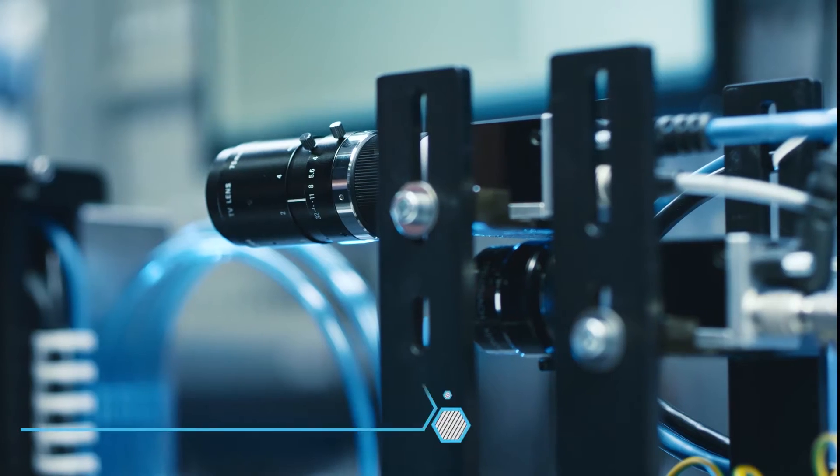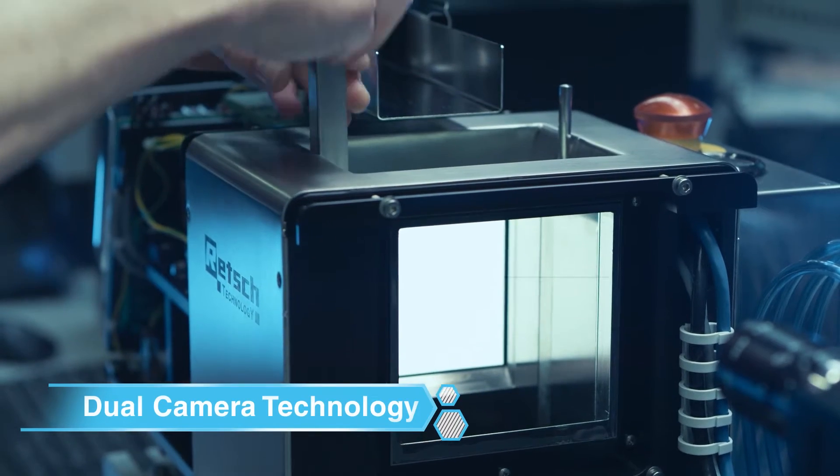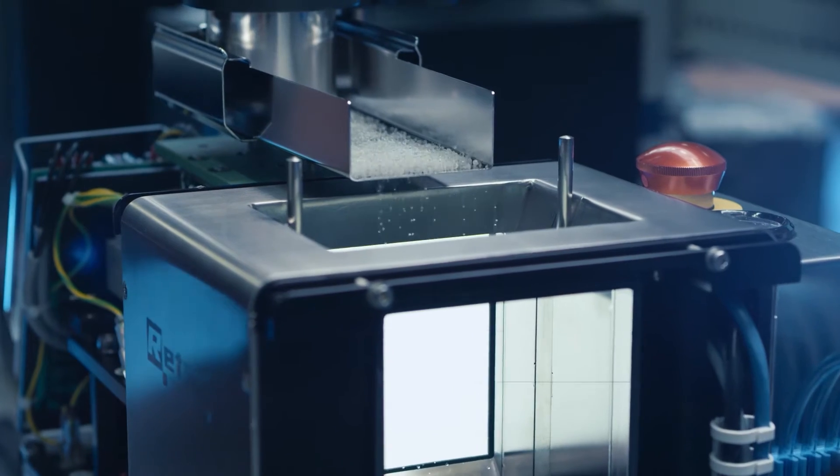With the invention of the dual-camera technology, we substantially influenced particle analysis technology and continue to set the standards in this area.